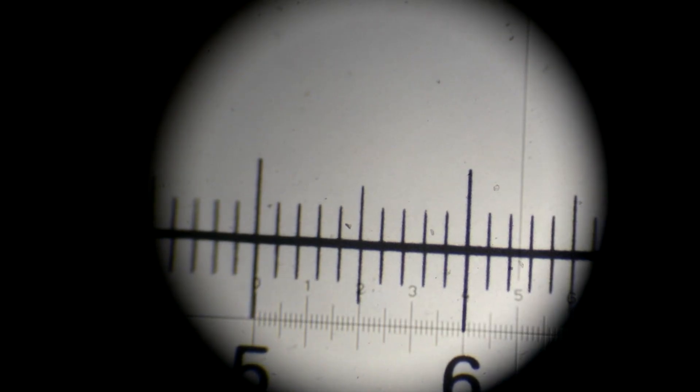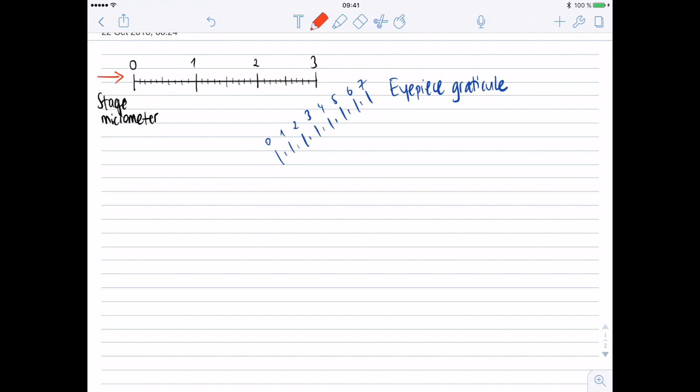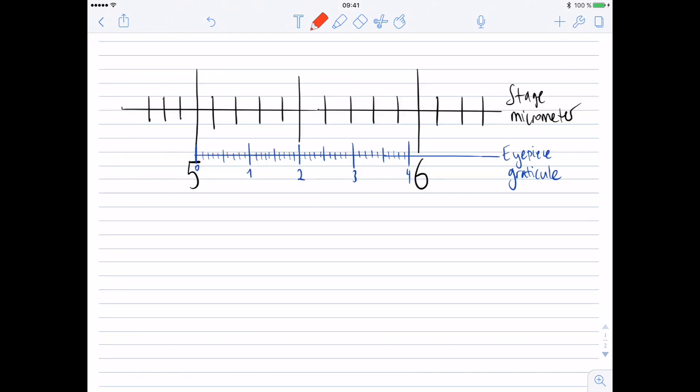If I overlap zero on the small scale with five on the big scale, you can see that small two overlaps with 5.5 as well. The black scale you see here is the stage micrometer and the blue one is the eyepiece graticule. To superimpose them, you can move the stage micrometer up, down, right, or left, and you can rotate the eyepiece graticule by simply rotating the eyepiece lens.